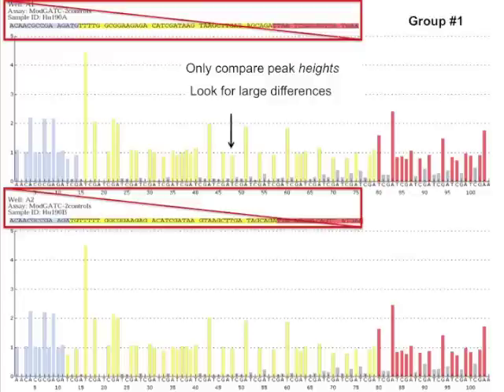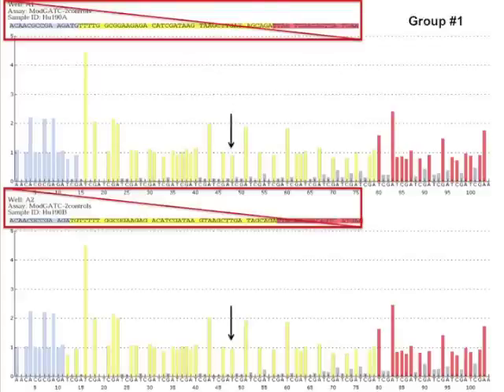At dispensation 48 here, this is a T. The machine has called out about 1 nucleotide, and if you look at the corresponding peak in the next pyroprint, it's roughly about the same place. So again, the machine would have called out 1 nucleotide, or 1 T, for that particular location. The differences between them are very subtle, so this is not something that we would consider a difference. And if you went through the entire pyroprint, you would find that there are really no major differences between them. So these pyroprints would be considered a match.